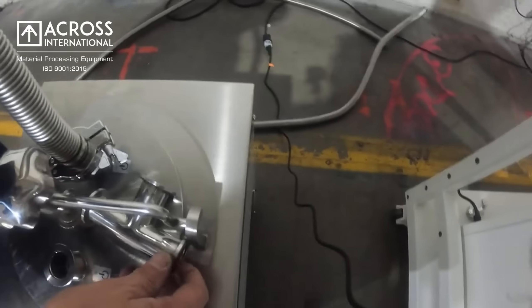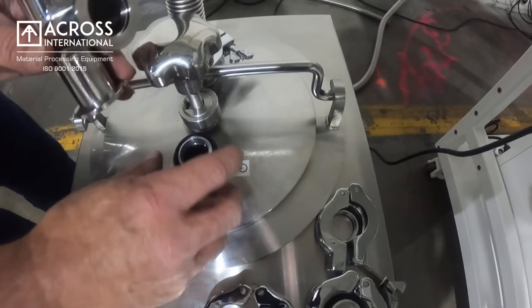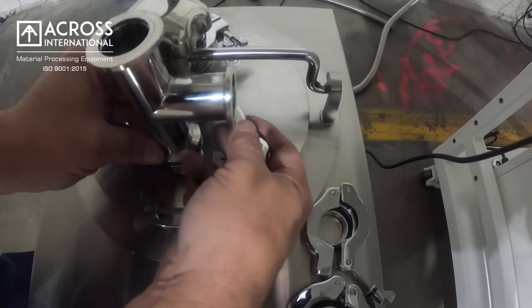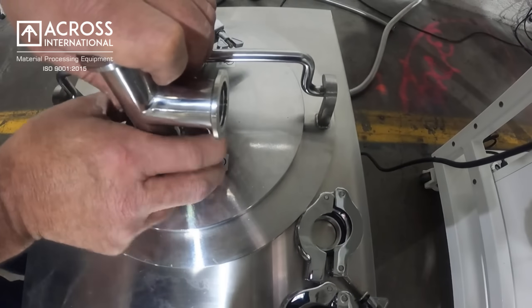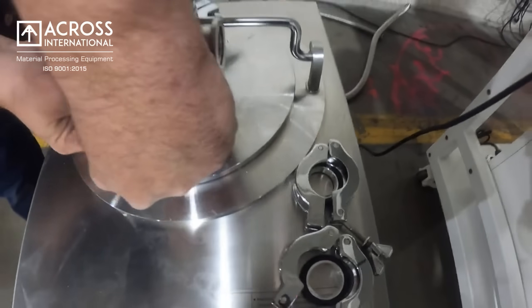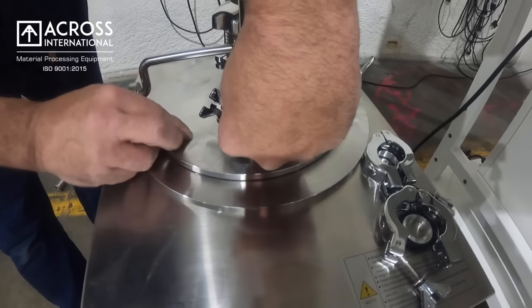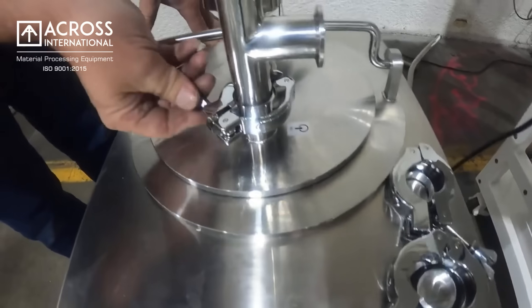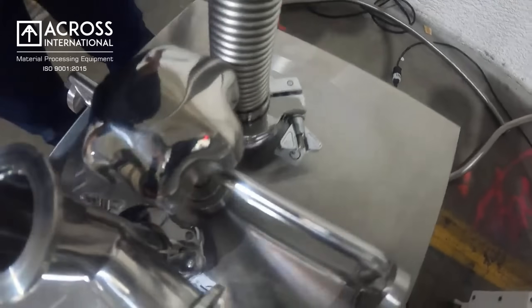Next we'll be installing a T on the end part of your cold trap with a KF 25. Secure your clamp and we will be moving to the back of the oven.